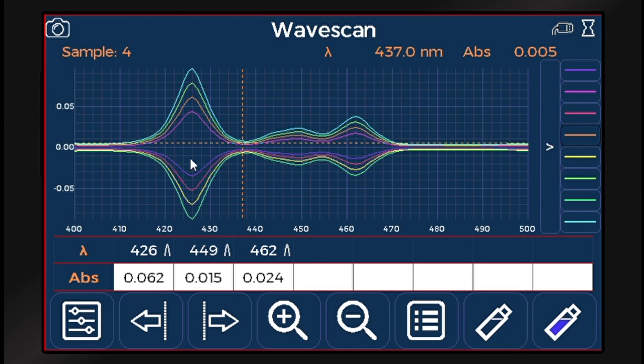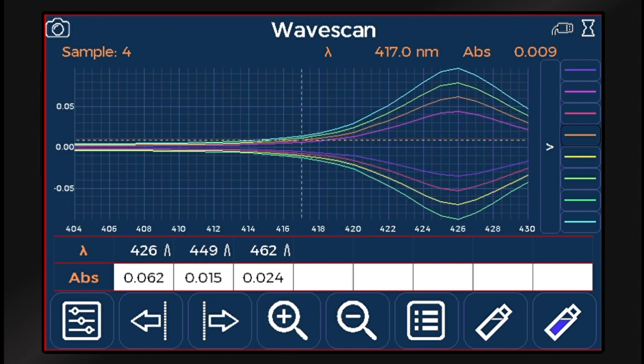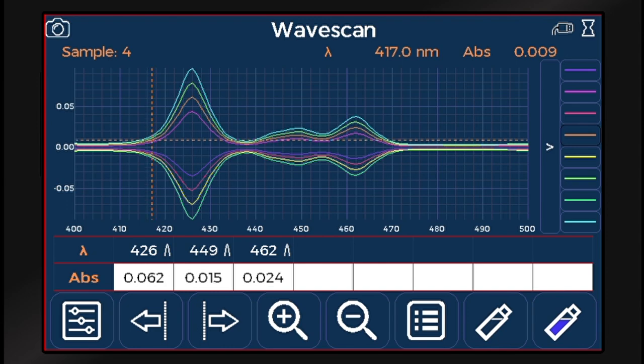The color touch screens allow for excellent visibility of sample overlays and even include a screen grab function for easy record keeping.